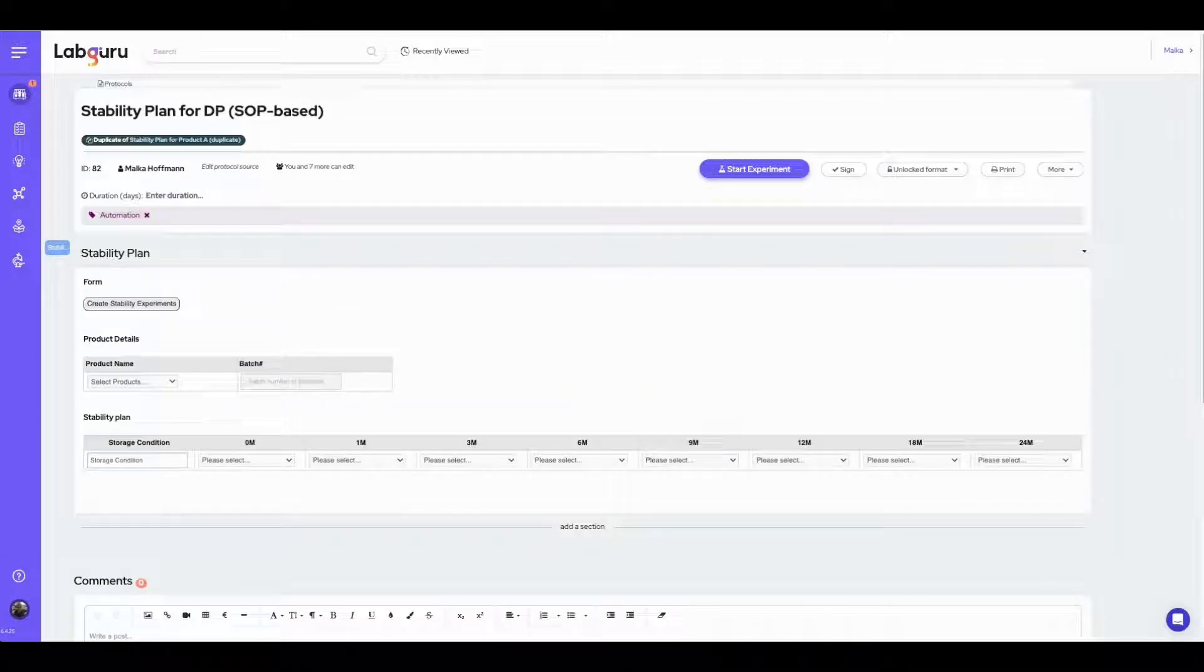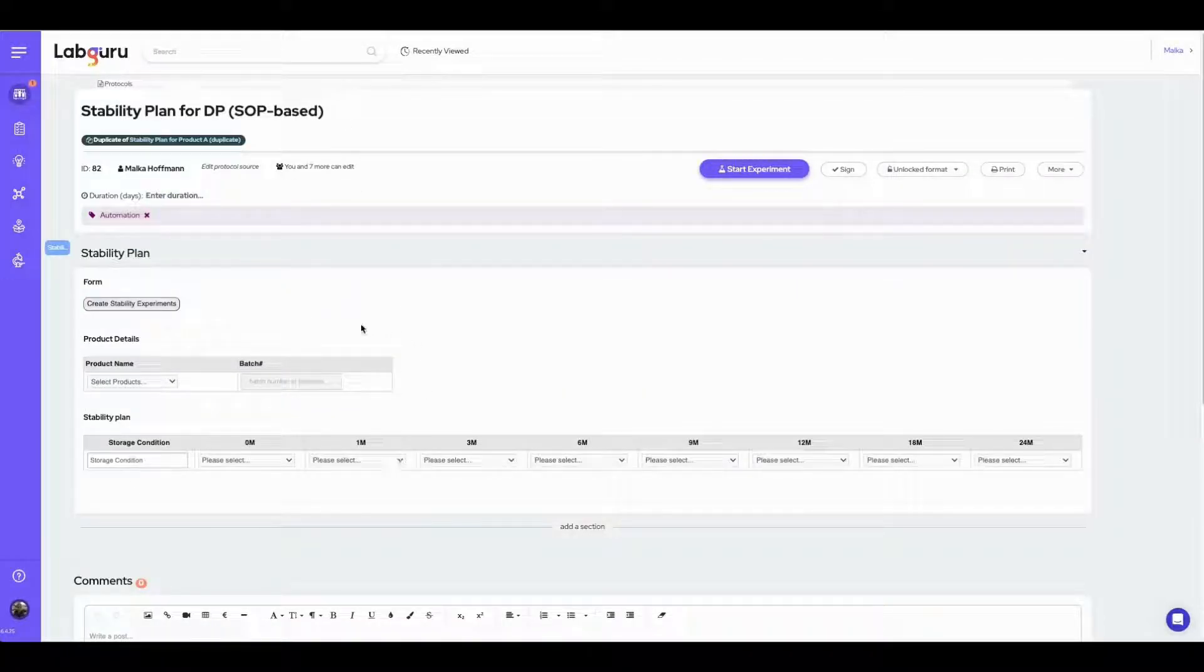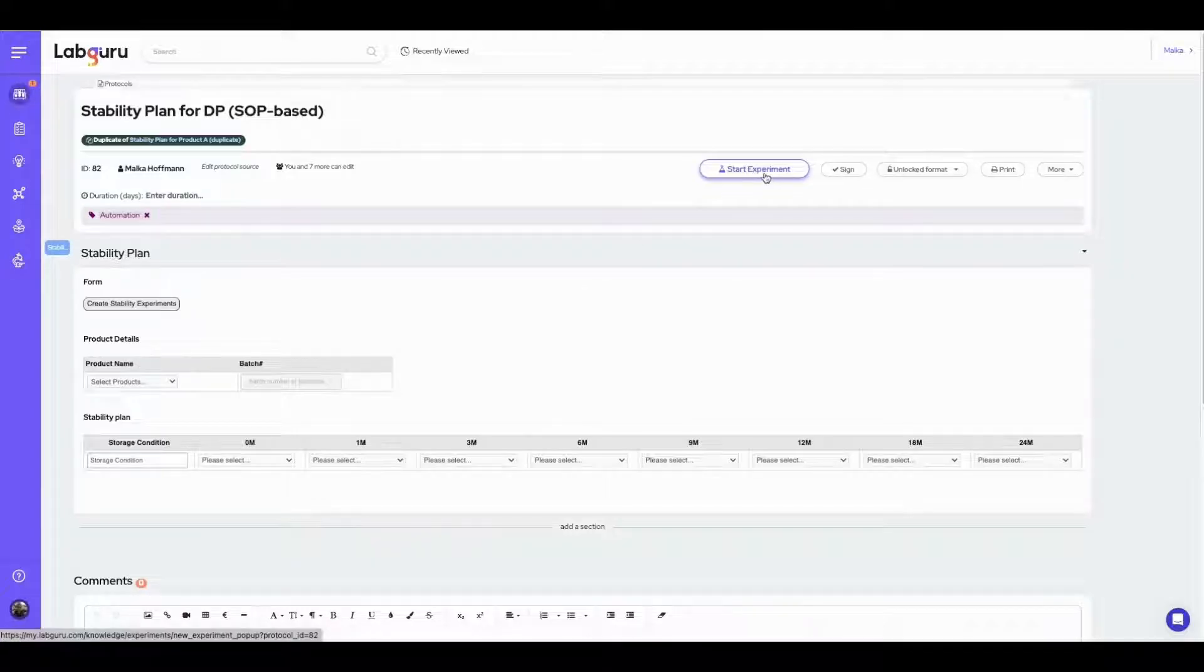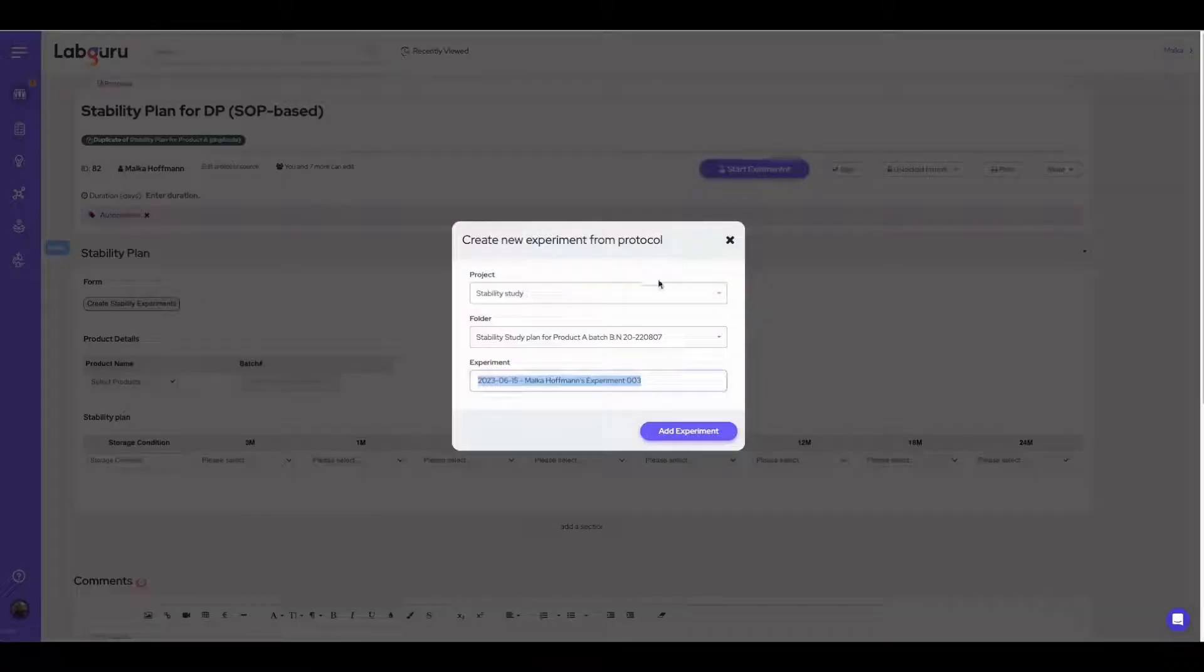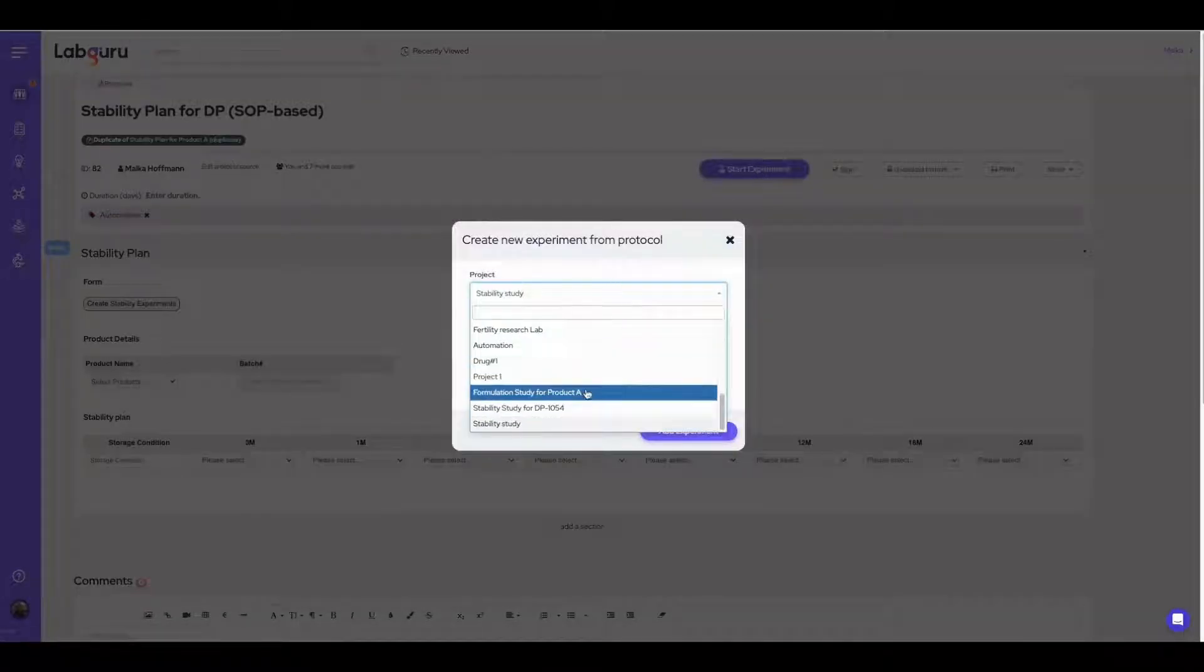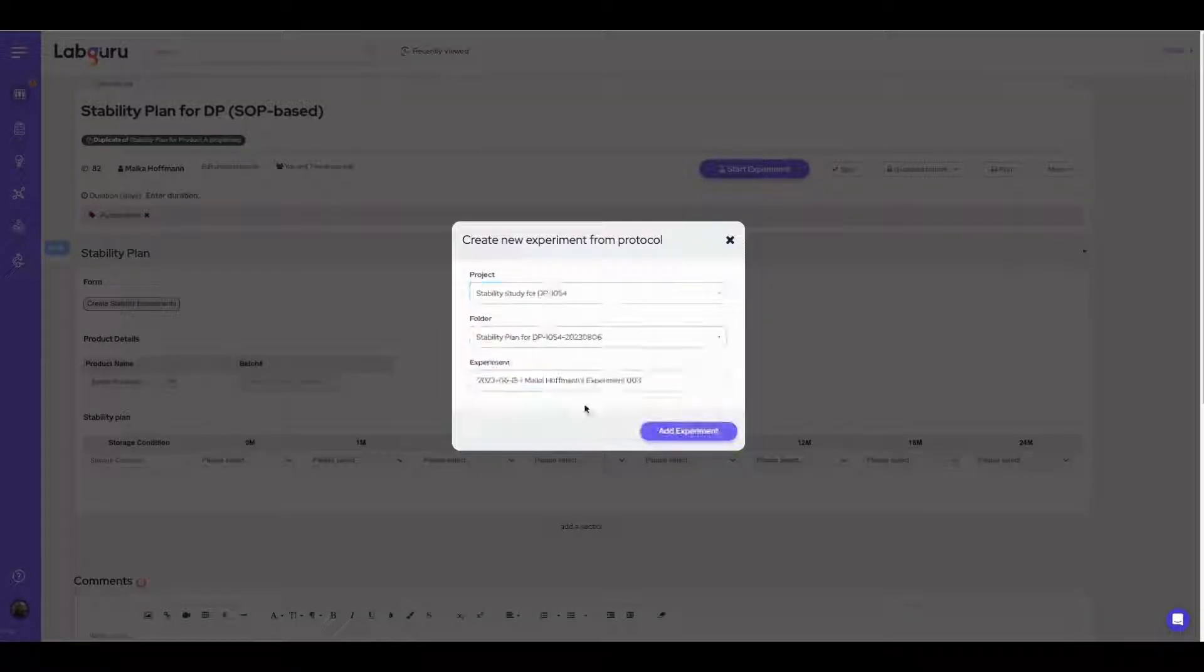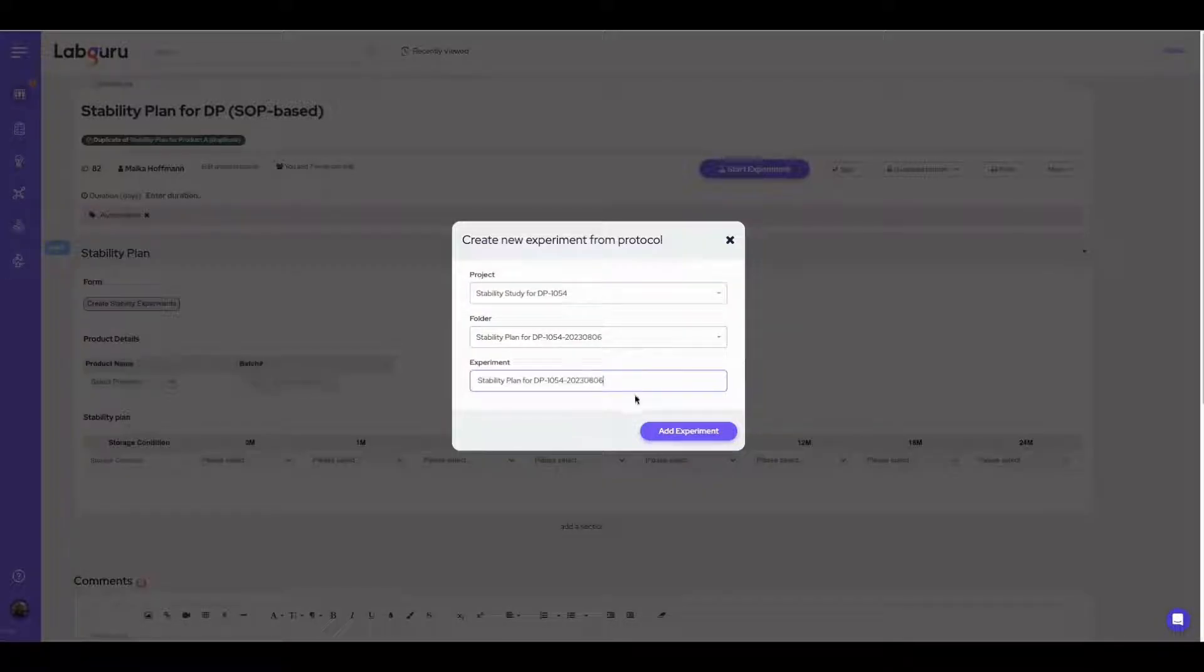We have a stability plan template intended for choosing the products and the required tests at each time point. To populate the template, an experiment should be initiated from the stability plan protocol and saved in the designated stability project.